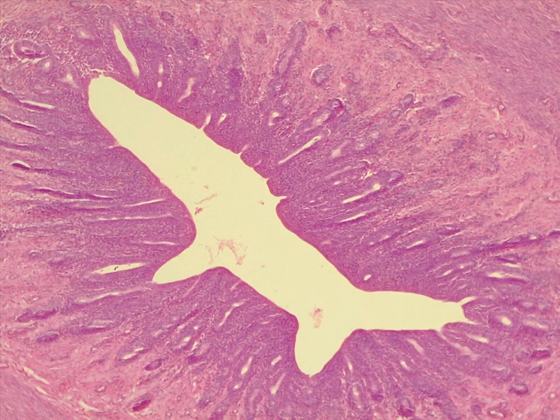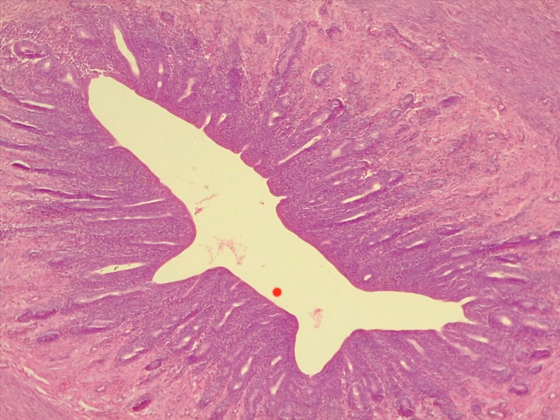This would be a uterus in diestrus. You can see that the cells look much more relaxed, there are fewer blood vessels associated with them, there's less of a lining, and the inside opening is more relaxed. Those are all of the slides of the reproductive system.